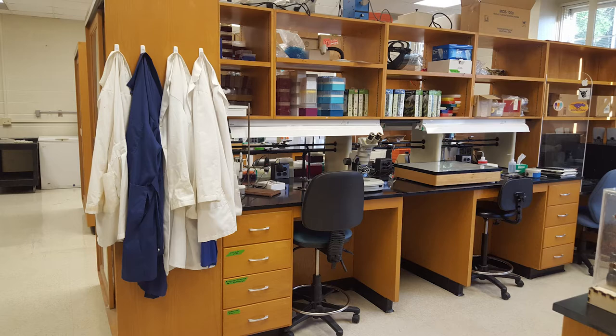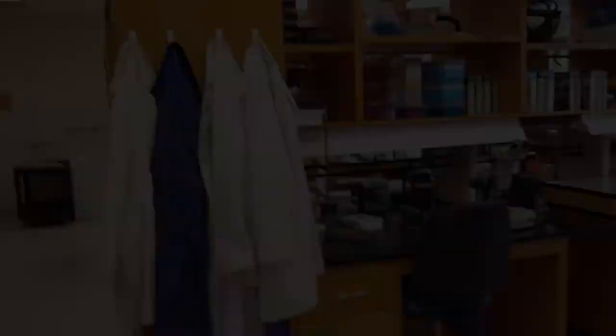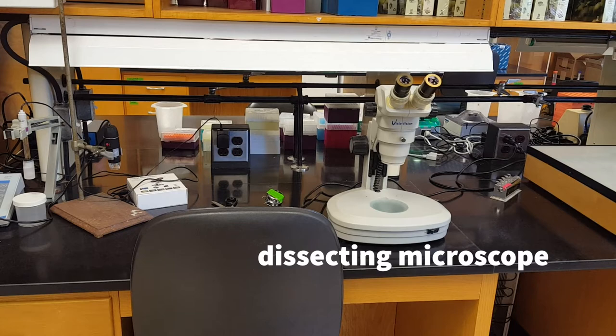Our main lab space is made up of several rows of lab benches, and each of these benches is set up with stations for the different kinds of work that we do. In this first row you can see our lab coats hanging up. Next to those we have a microscope workstation — a specific type called a dissecting scope, which allows us to take a closer look at large samples without having to prepare microscope slides.